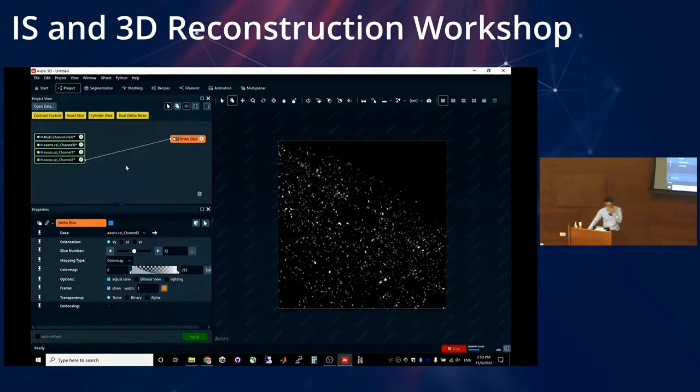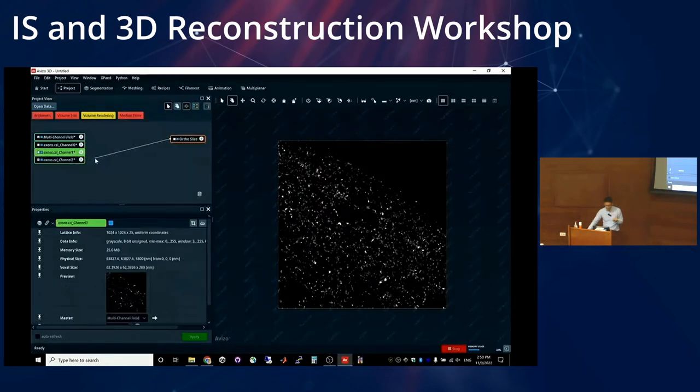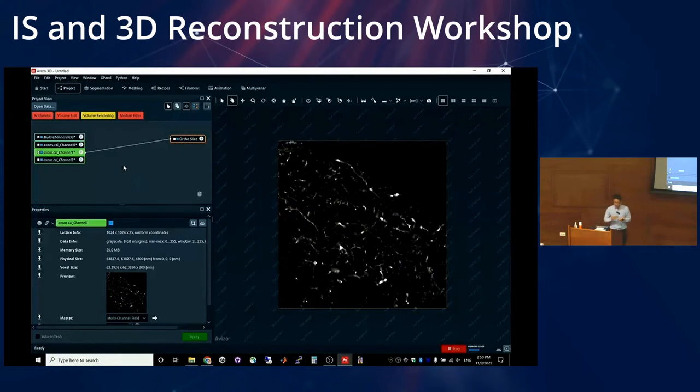So just to give you some background, what the user is doing is that before they do the scan on the mouse brain cells, they introduce some chemicals, right? And the goal of the chemicals is to try to stick to axons, okay? If Julia, if you're here, if I'm saying something wrong, please let me know. But yeah, they're trying to see how the chemicals are attaching to the axons, okay? So in her term, she calls this co-localization. In my world, it's just intersection, right?